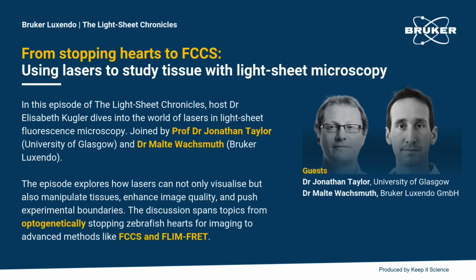This takes me back to what I said before, that you can use this to also calibrate a fluorescence image. It's something we've done a lot in earlier days with confocal imaging. So you can measure a concentration at a spot, also have an intensity value at the spot, so I know to which concentration a certain intensity value corresponds. Like this, you can calibrate your intensity images, and you can also correct for these inhomogeneities of illumination that we've discussed before in light sheet microscopy.